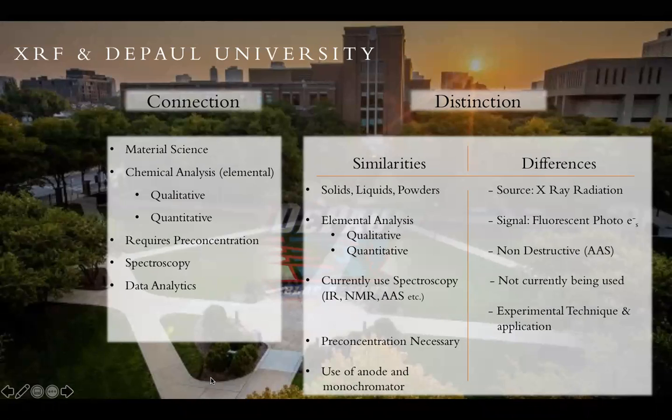So what is our connection to chemistry? It's a material science tool. It does elemental chemical analysis, both qualitative and quantitative. It requires pre-concentration or the creation of standards as well as dilutions for the appropriate analysis. It is a spectroscopy tool, and data analytics is involved.